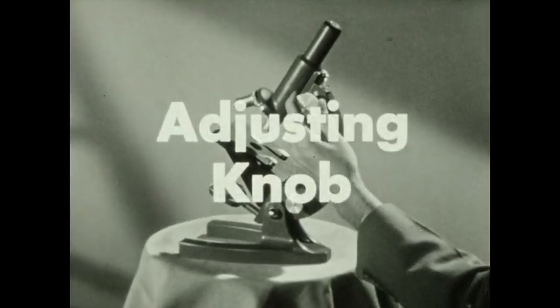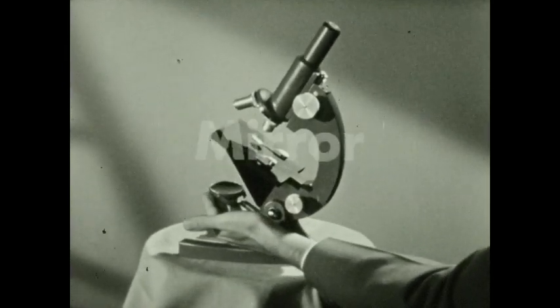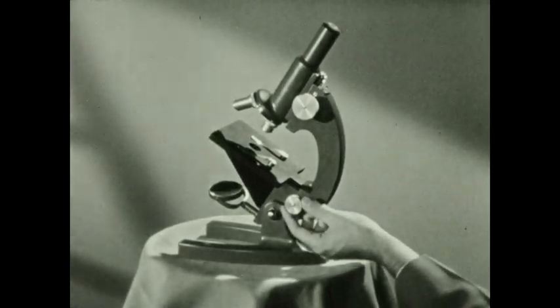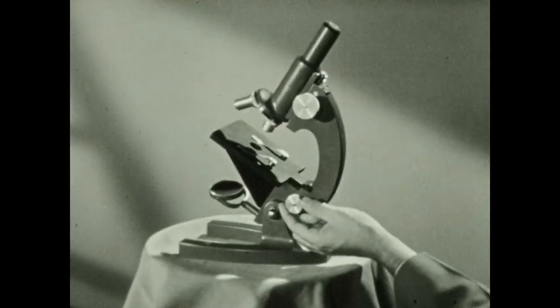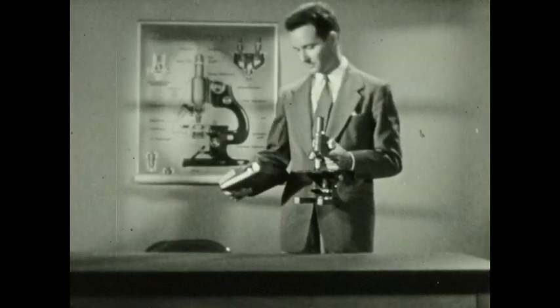The adjusting knob is used for focusing, and the mirror for reflecting light onto the specimen. An additional focusing knob is found on most modern microscopes. It is used for critical focusing, which we'll learn more about shortly. So you're ready to begin using the microscope.